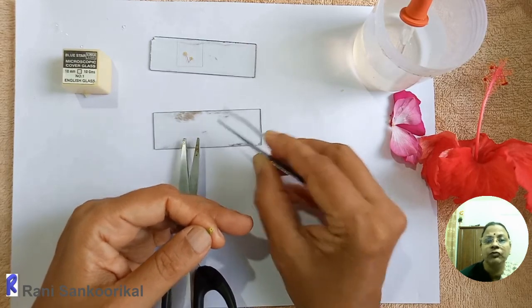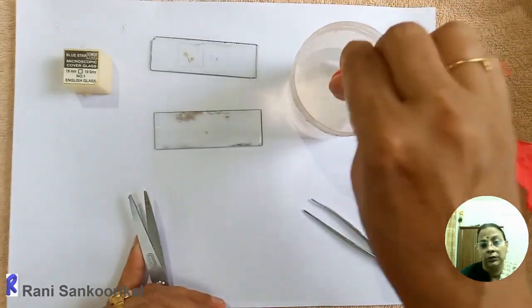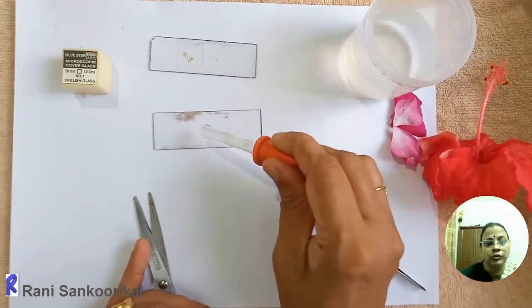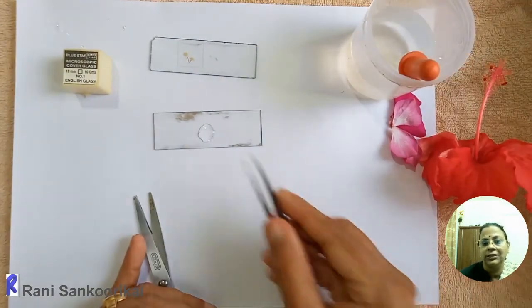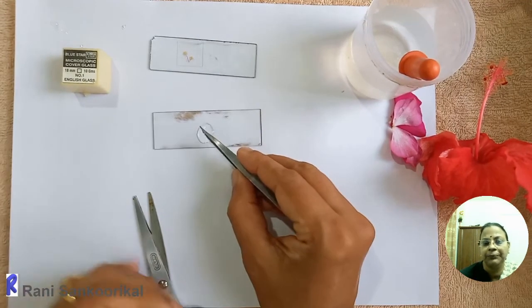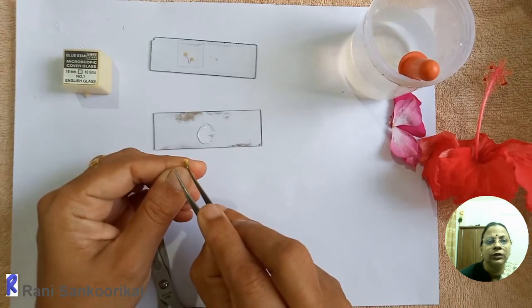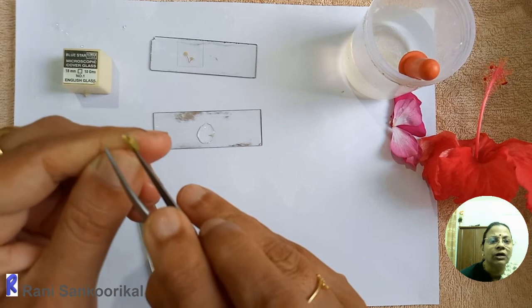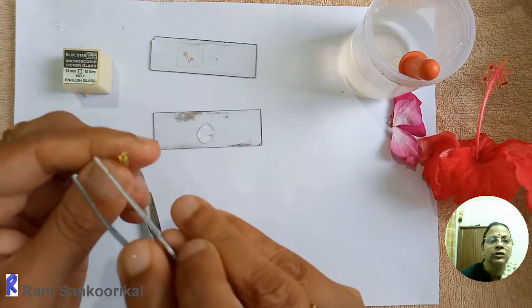The same way what we have done with the hibiscus, same way pour 10% of sugar solution or sucrose solution, place it. There also you have to gently squeeze it or you can tear it off. That is to separate the pollens from the anther. Okay, so if you want one more, because since it is very minute, you can take one more anther lobe like this way and place it on the slide.